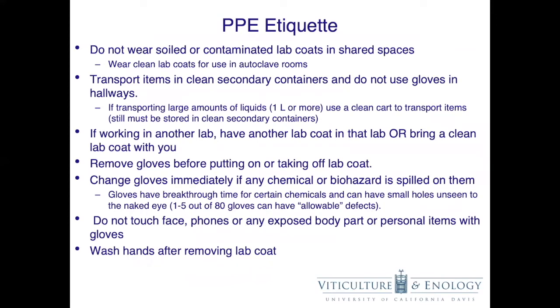I would also like to discuss some PPE etiquette. Do not wear soiled or contaminated lab coats in shared or public spaces. This is true for both chemical and biological contamination. Wear clean lab coats for use in autoclave rooms. Do not eat or drink in your lab coats. Unfortunately, I've seen too many people in these buildings do this. I know not many of you will be working with hazardous materials. This is still something that should be abided by, for the same reason that you should not eat or drink in your lab.